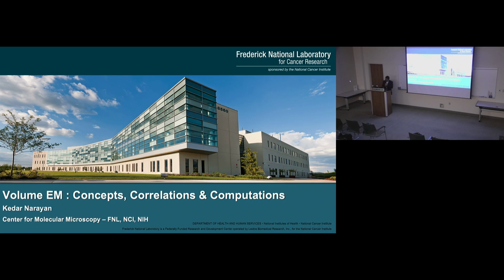All good? Okay. So my name is Kedar, and what I'm going to be doing today is talking to all of you about an approach that we and others have been developing in the recent past. It's called volume electron microscopy.